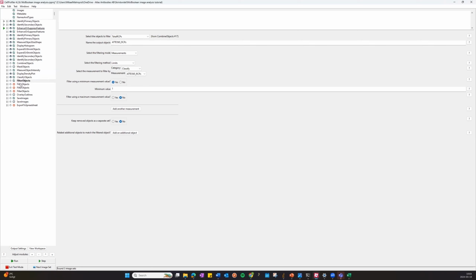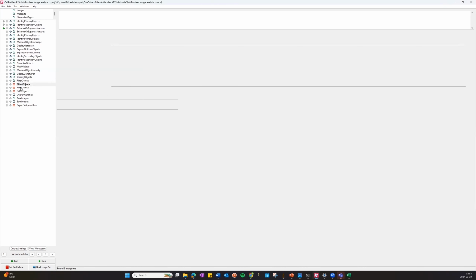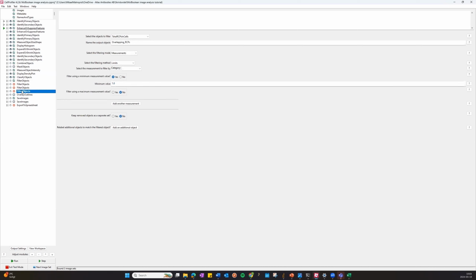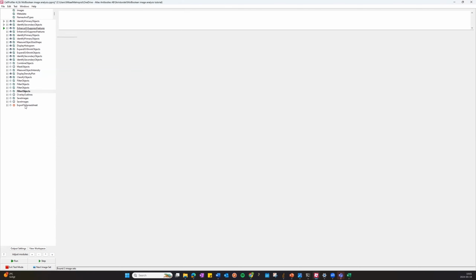And then you do the same for all three of these ones. Same thing for all filter objects modules. Click on them, go change total RCPs. Total RCPs. So that should remove the error messages from them all. And the very last thing is to go to the export to the spreadsheet module.